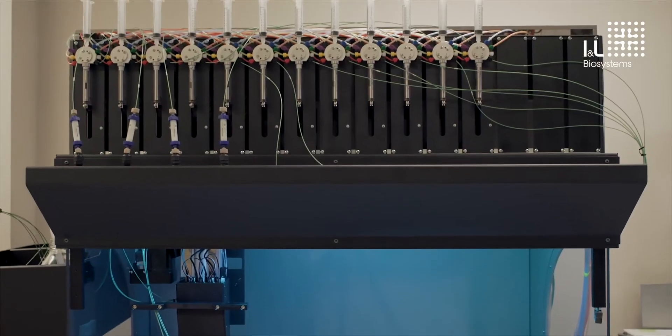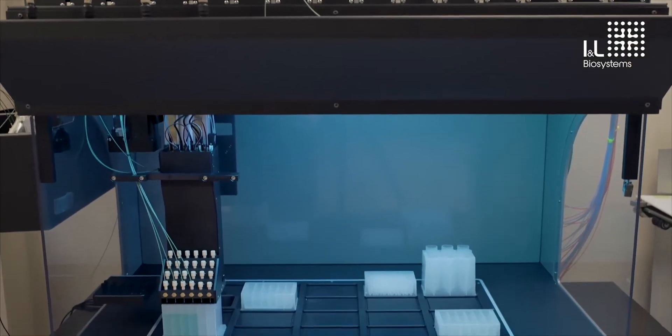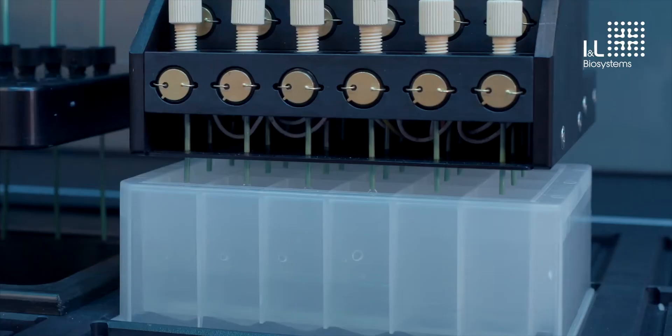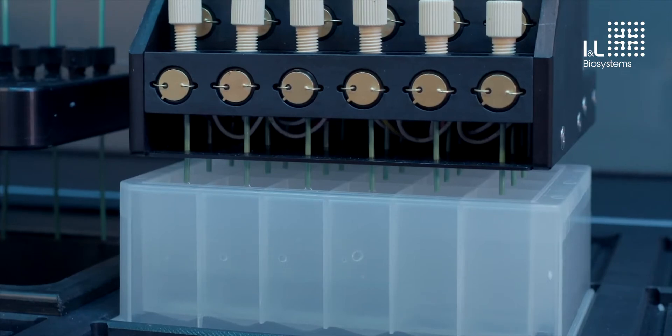This instrument is brand new, still undergoing the final stages of quality assurance before being shipped. Before we do a demo run, let's start with a general introduction to the system components.